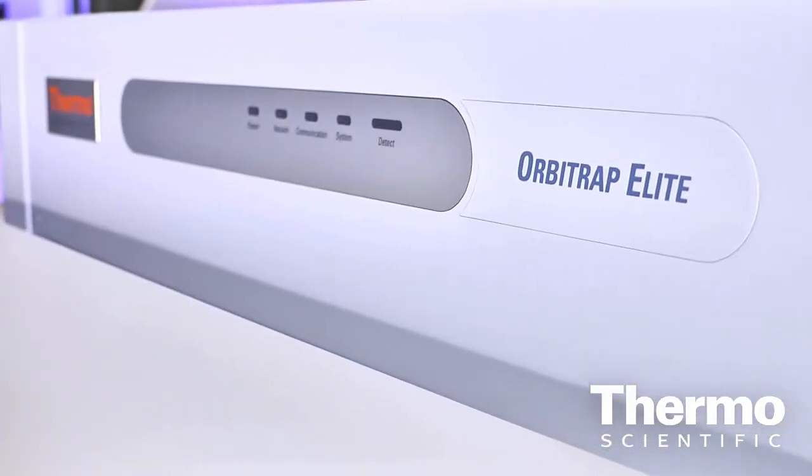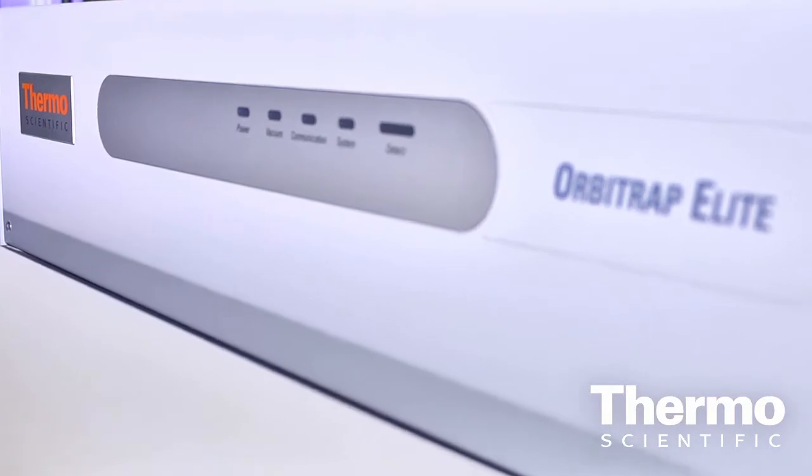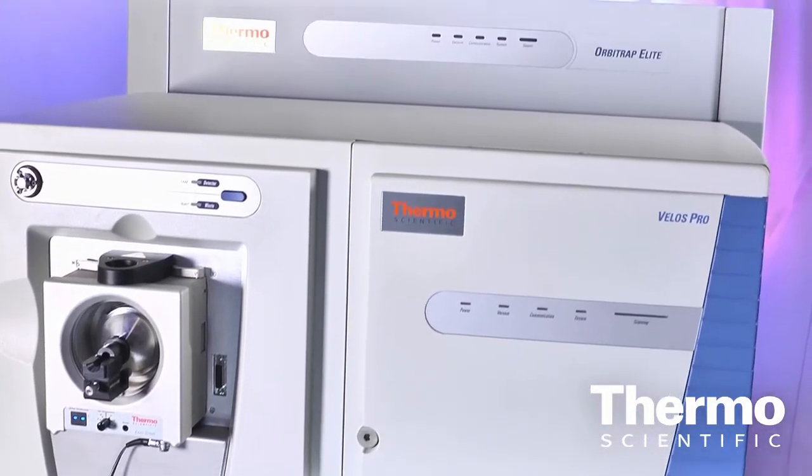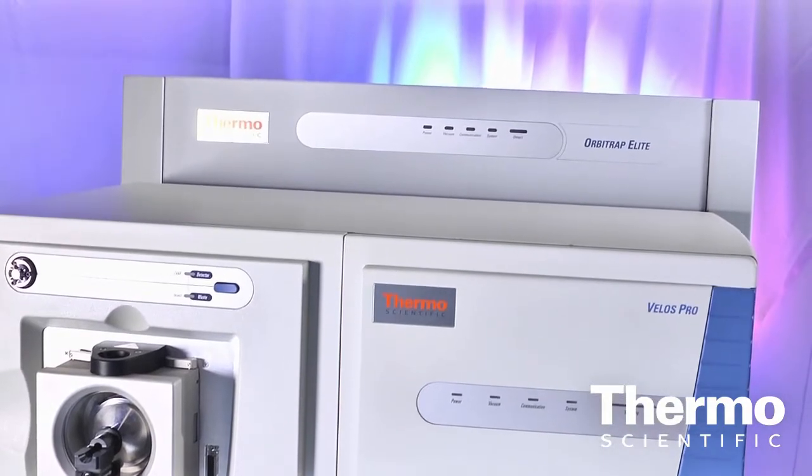Then we have a very unique acquisition strategy that's available on our Orbitrap-based instruments, especially our Orbitrap Elite. It's called HCD product-dependent ETD, higher energy collisional dissociation, product-dependent electron transfer dissociation. What's happening is that we use the HCD as a way to probe in our sample whether we see glycans or not. So in the HCD spectrum, we see diagnostic glycan oxonium ions, and we use those as a means to trigger ETD on the same precursor.